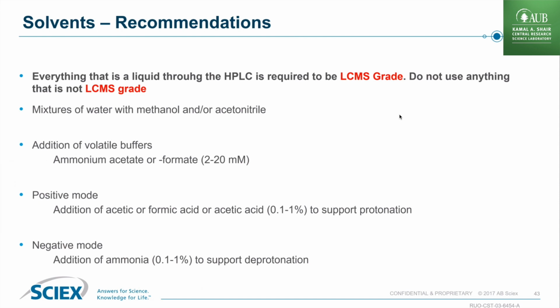This is a full scan instrument. Full scan instrument means it is detecting everything in a mass range. Everything. It's not targeted on one thing. If your solvent is dirty or contaminated, then those contaminants will show up as ions in your mass range and will complicate immensely your task in the data analysis.